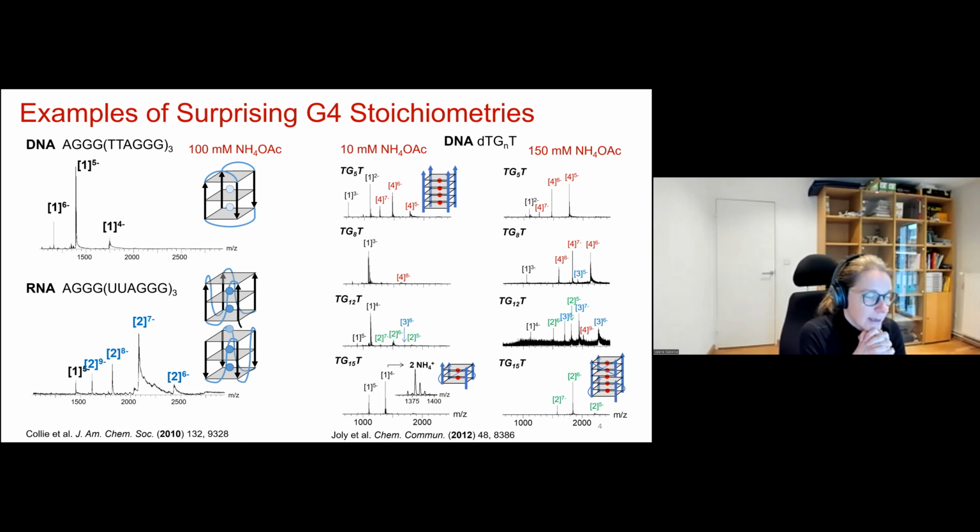G threads. Based on this cartoon, Antoine Fan later studied this sequence by NMR, and found at high resolution that the topology we had predicted thanks to mass spectrometry was confirmed in the high resolution structure. And we've also seen a difference with the annealing conditions. If you use low ionic strength or high ionic strength, you are going to form different stoichiometries if you anneal those sequences.